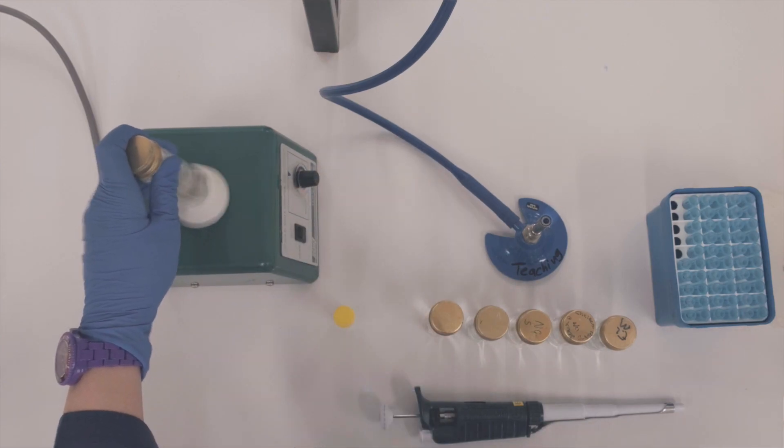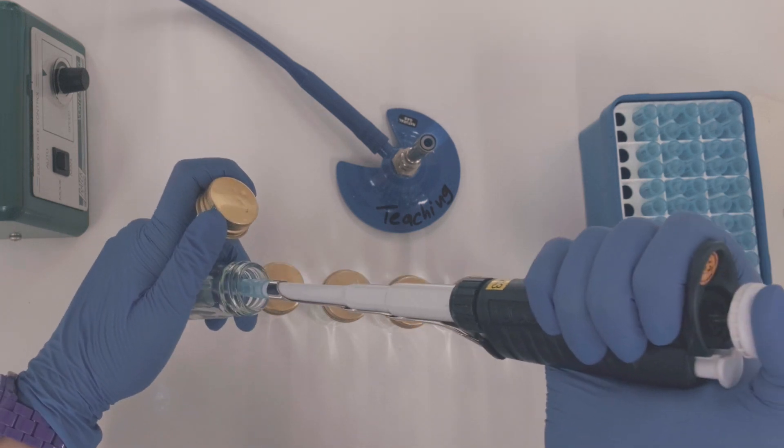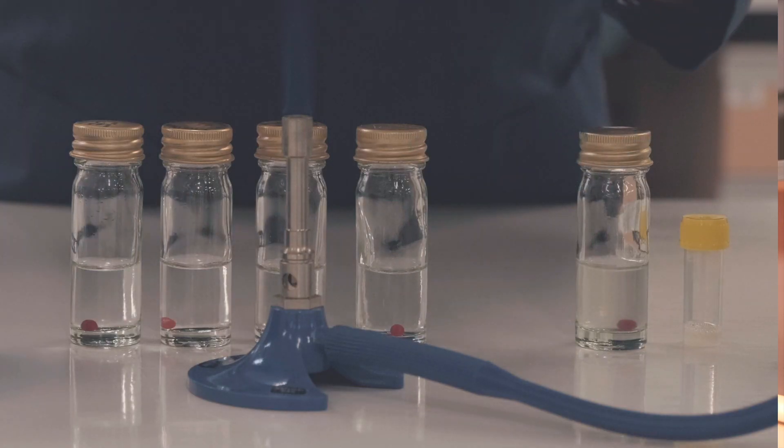The bottle is vortexed to thoroughly homogenize the sample. There is now a total reaction volume of 10 milliliters in this bottle, so this is the first 1 in 10 dilution. 1 milliliter is then extracted from this bottle and added to the next 9 milliliter bottle of saline.